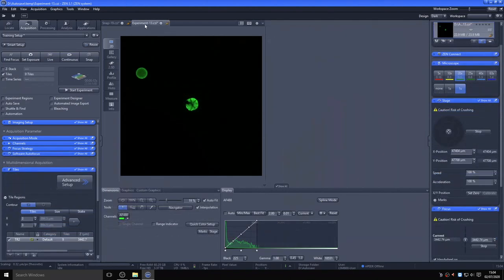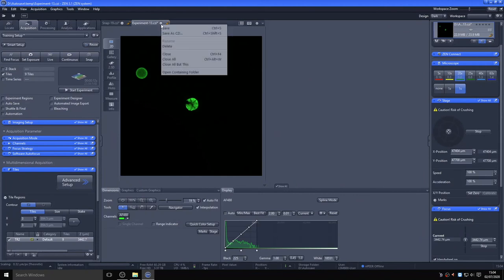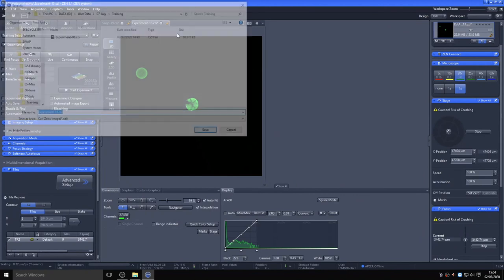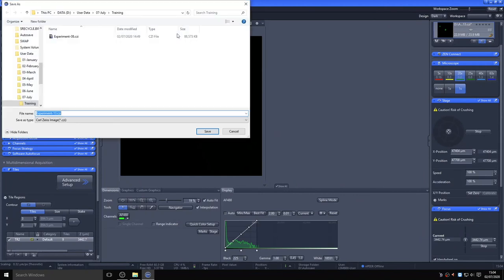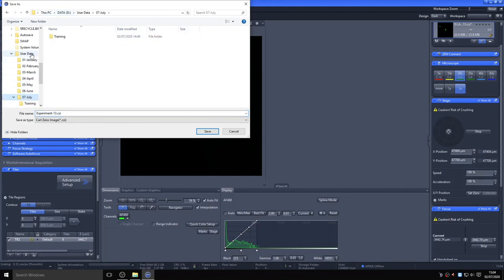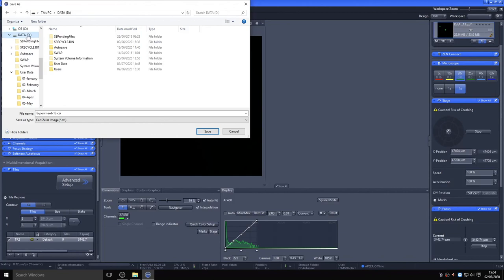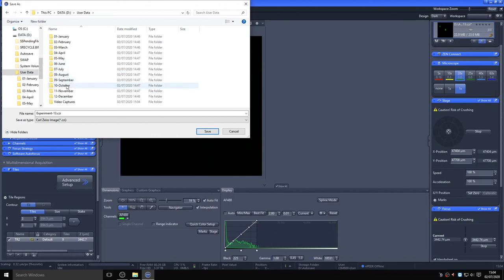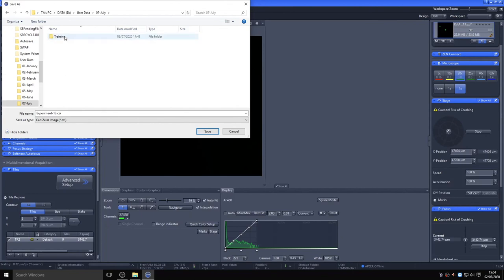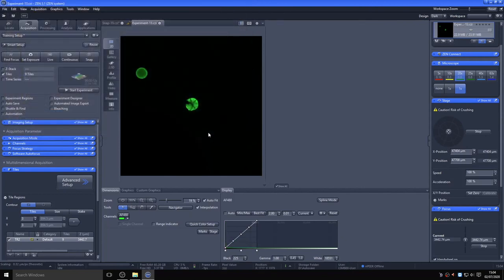Once you are happy with the images you have collected and want to save them, right-click on the name of the file at the top of the image and select Save As CZI. If you navigate to the D data drive, within a user data folder you should see some month folders. Create yourself a named folder inside here and save your file to this directory. Once saved, you will notice the asterisk by the file name will disappear, and the image can be closed.